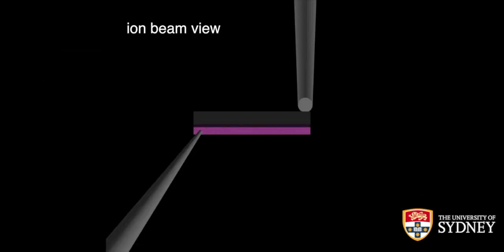So with the support structures, there's one thing that I always tend to do before I do the actual lift out, which is cutting the support structure. If you have the micro tip arrays, you don't actually need to do that, but I still do it because it gives you a fresh surface. If you use the grids, you need to do it anyway.